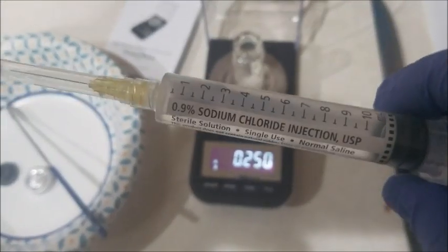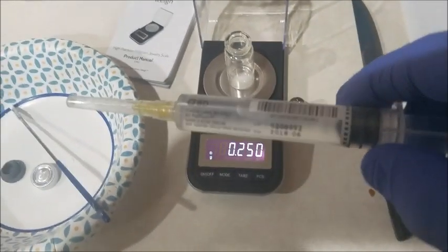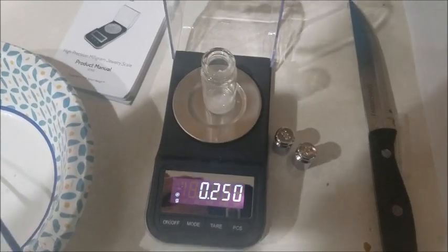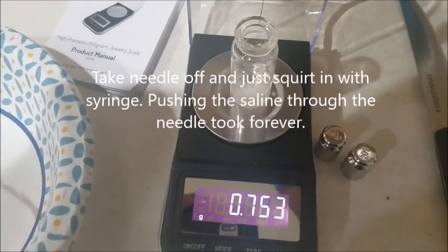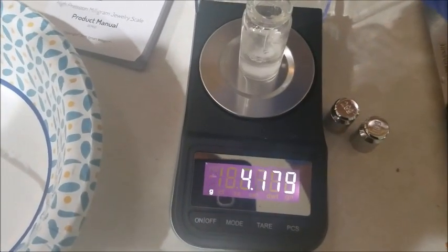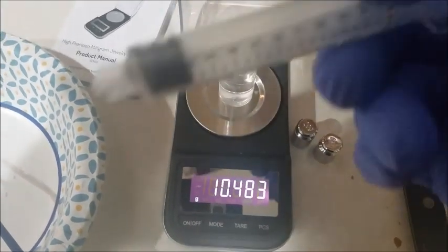Now the next step of this is we need to add 10 milliliters of 0.9% sterile sodium chloride solution. These are pre-filled from BD. They're great. We're going to undo the cap off the needle. And now we're going to add that 10 milliliters of sterile solution to the lidocaine powder. Alright, in the end there I decided to take the needle off. It was taking way too much time. So we're going to fill this up. Now we've completely emptied the 10 milliliter.